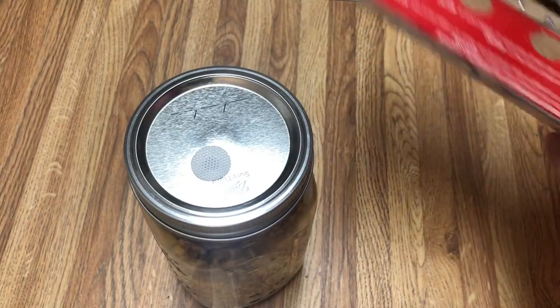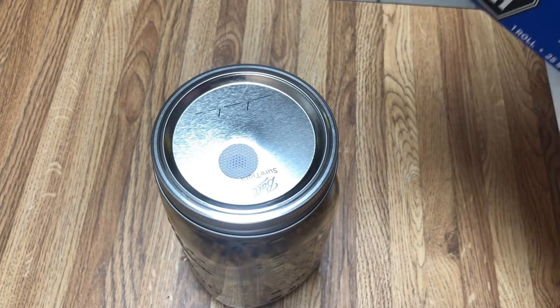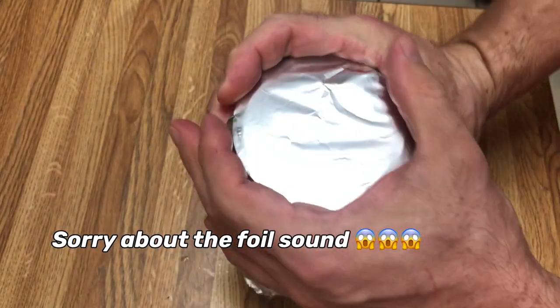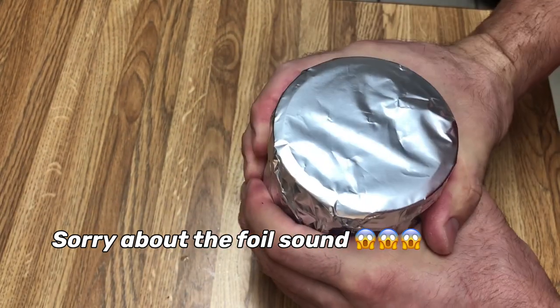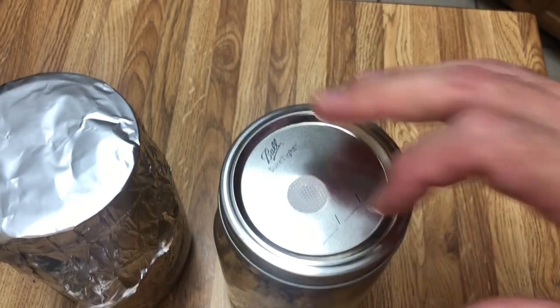Okay, so now we're gonna load up our grain jars into the pressure cooker. They're filled, they're all about halfway. So I decided I'm gonna use all these for grain to grain, so I was actually able to fill 9 jars, which is pretty much what my pressure cooker holds. So for the jars that have filter pads on them, you need to use tinfoil. If you don't use tinfoil, they'll last about 1 or 2 pressure cook cycles before the filter pad falls off.